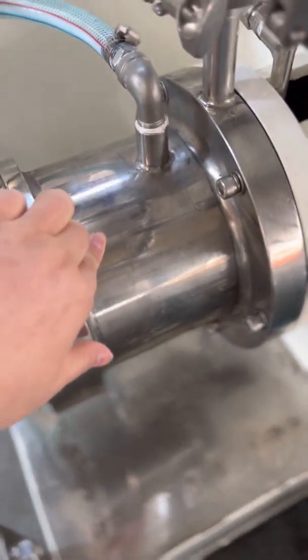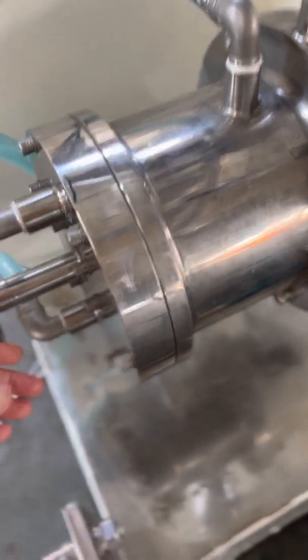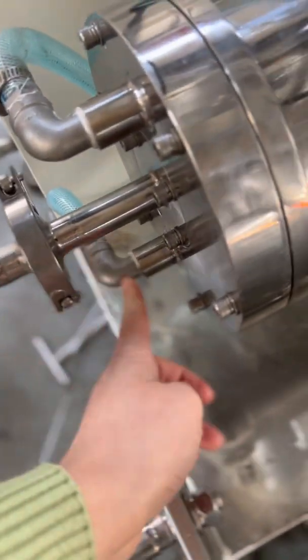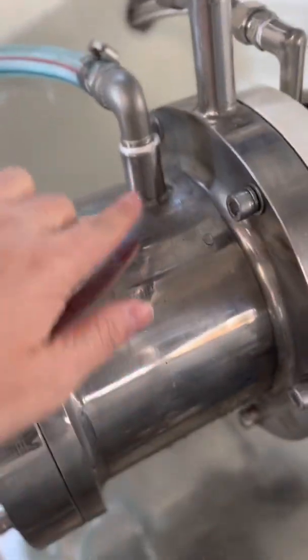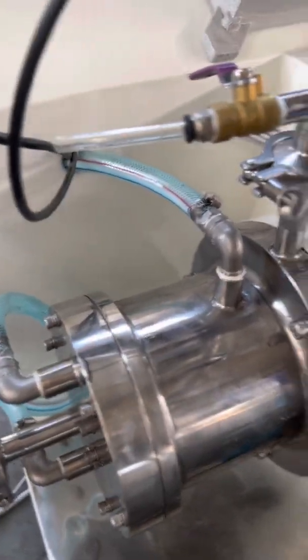The grinding chamber has a jacket for cooling. You can see the cooling water inlet and outlet, and the inlet and outlet for discharge and cooling water.